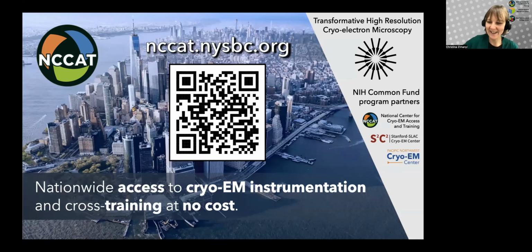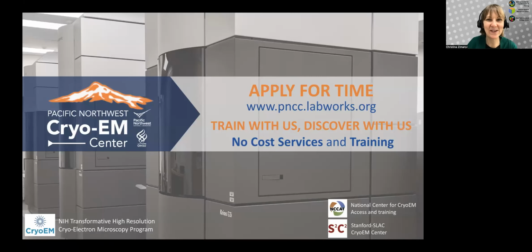Hi, I'm Jeanette. I'm a microscopist at PNCC. We have 2 different types of proposals. One of those is our screening access, where you can apply to come on site for up to 5 days to just make grids and screen them with staff. That's for people that might not be able to freeze grids otherwise. Then we have our general access, which gives you 480 hours of microscope time a year over 2 years, which we can do screening or data collection at that time.